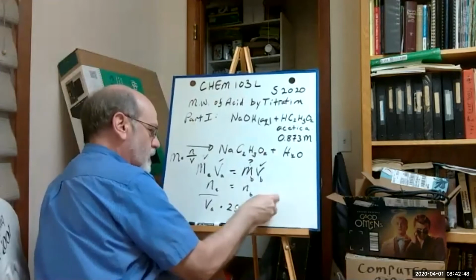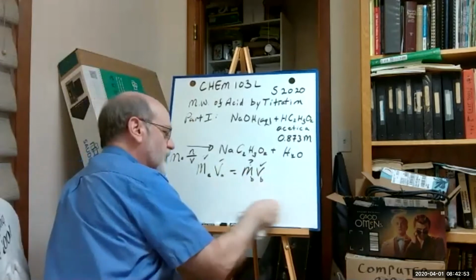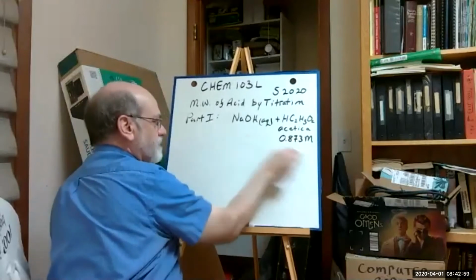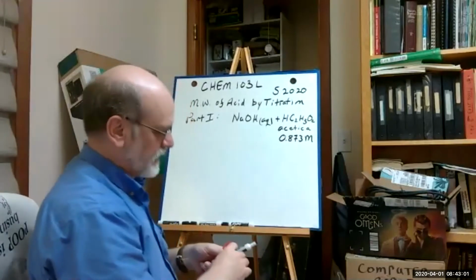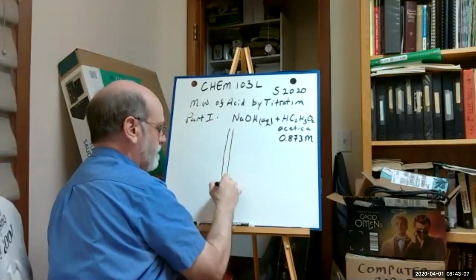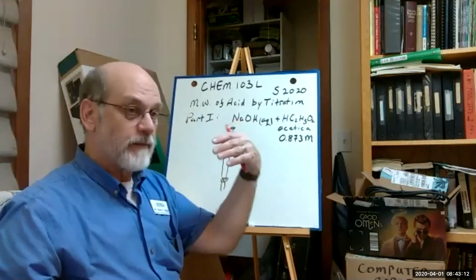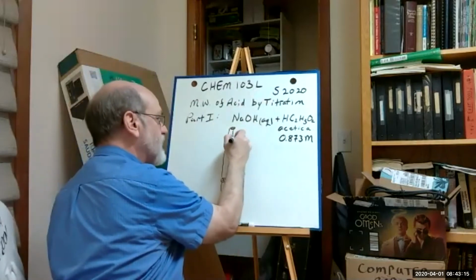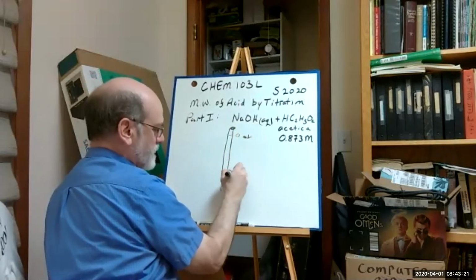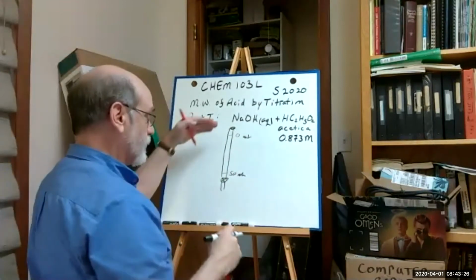Now recall from the video, it may have not been obvious. How do you determine the amount of titrant delivered during the reaction? Well, the burettes are calibrated not from bottom to top, but from top to bottom. So 0 is up here, and for our burette, 50 milliliters is down there. So you have to read it from top to bottom.